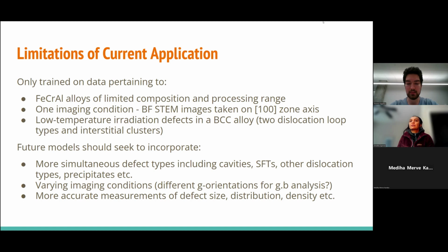I think that's the key feature, in the sense that you're not just getting defect density, which you could get from UNet, but you're also getting size information, size distribution, that kind of stuff. It's just giving you more quantitative information than you would get from a semantically segmented image. In terms of efficiencies and things like that, I didn't research UNet too much. I just thought this was a comparison in terms of what it's capable of doing in segmentation, at a bit of a higher level.